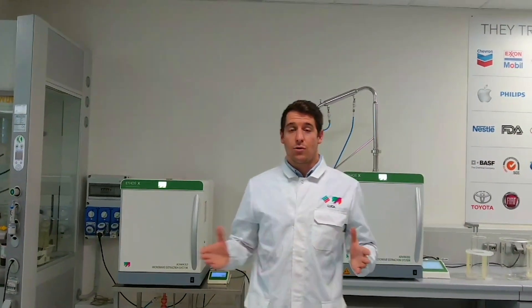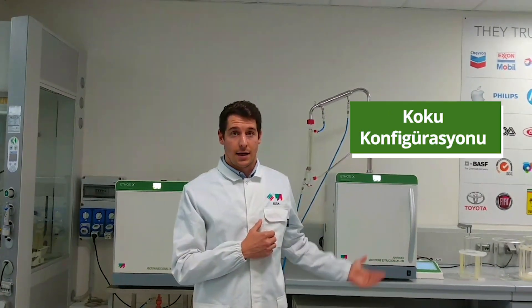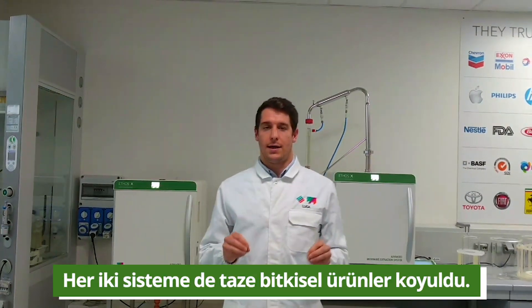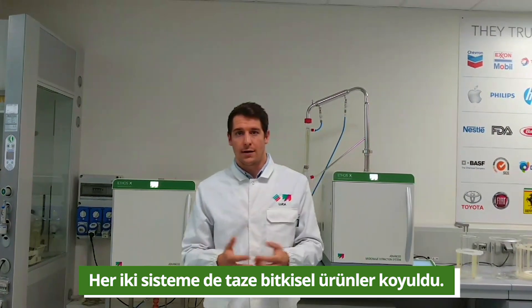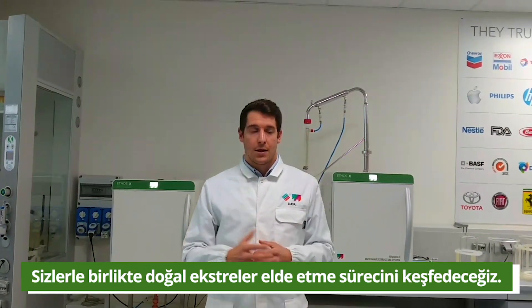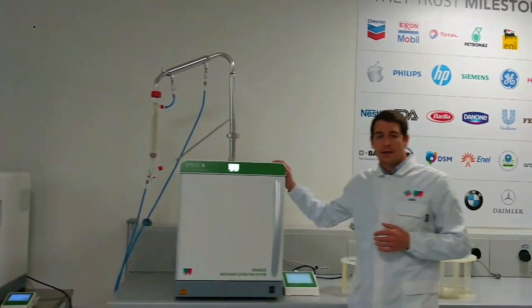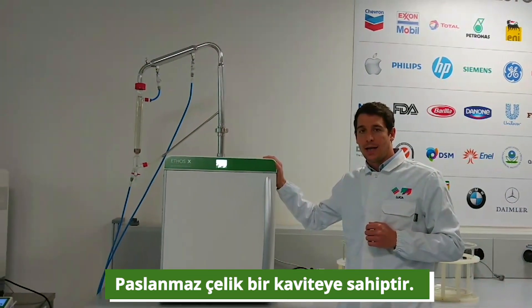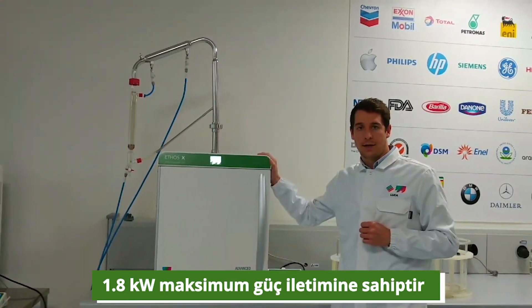Today I am glad to present you the two configurations: on your left hand side the flavors configuration and on your right hand side the fragrances configuration. Both units are already loaded with fresh plant material. The ethosX platform is a robust microwave extraction system made up of a stainless steel cavity with a maximum delivered power of 1.8 kW.